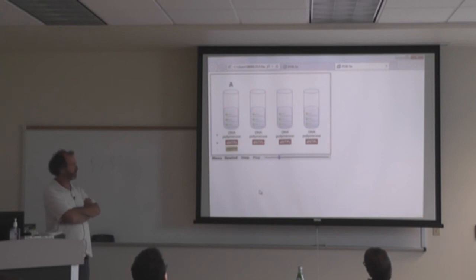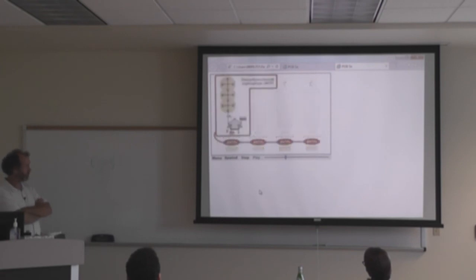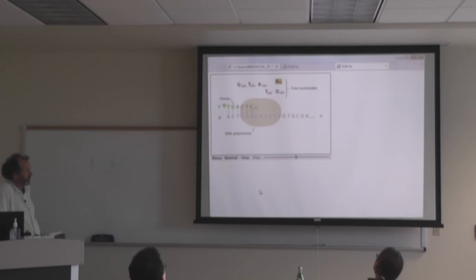One of the four 2', 3' dideoxy NTPs, or ddNTPs, is mixed into each tube at a concentration 100 times lower than the dNTP concentration. dNTPs differ from ddNTPs at the 3' carbon on the sugar molecule. dNTPs have a hydroxyl group attached to the 3' carbon, whereas ddNTPs have a hydrogen atom attached to this carbon. DNA polymerase uses the dNTPs to elongate the primer DNA. The occasional incorporation of a ddNTP terminates the polymerization reaction, since the absence of a 3' hydroxyl blocks addition of the next nucleotide.